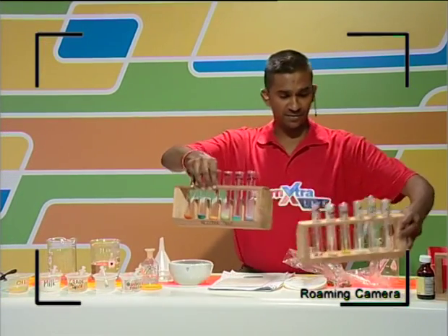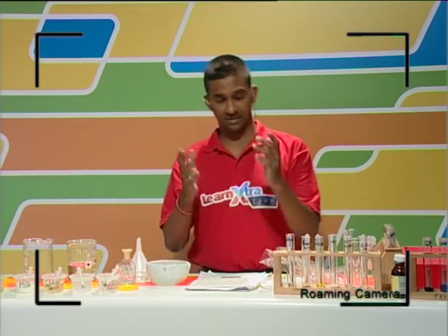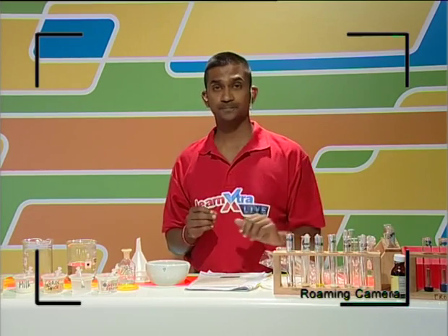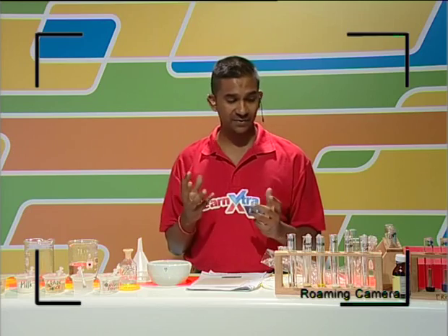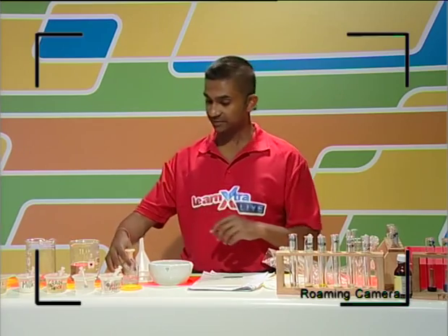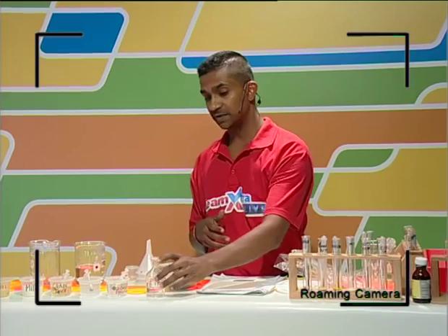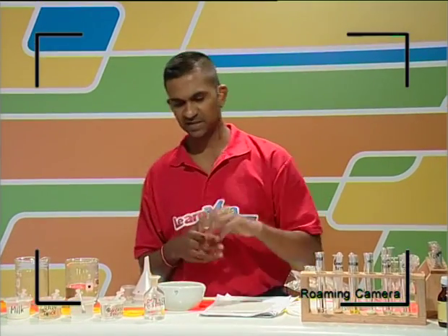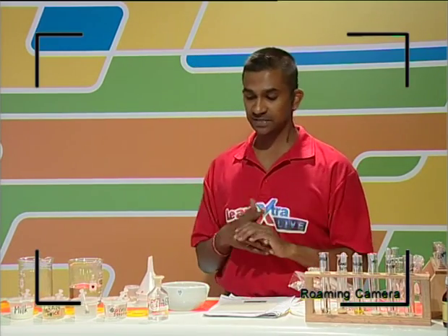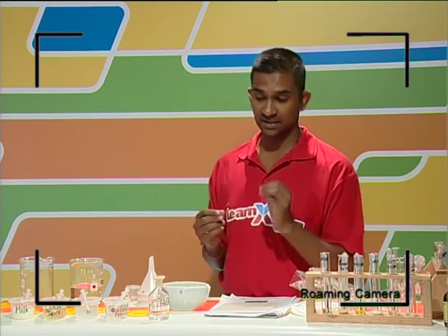In the meantime, I'm going to put these in front, and these are the test tubes that I was working on at the lab. So essentially we're going to test for the presence of lipids, and this is not a color test. This is a test where we emulsify the lipid in a substance. We treat it with ether, guys, and here we have ether, and this is a volatile, flammable substance, and I've got my bottle labeled with red, which means that it is flammable, it's dangerous. You never work with that around an open flame. You know the possible dangers of that. So it's volatile, can easily spontaneously burst into flames, and you've got to be very careful.